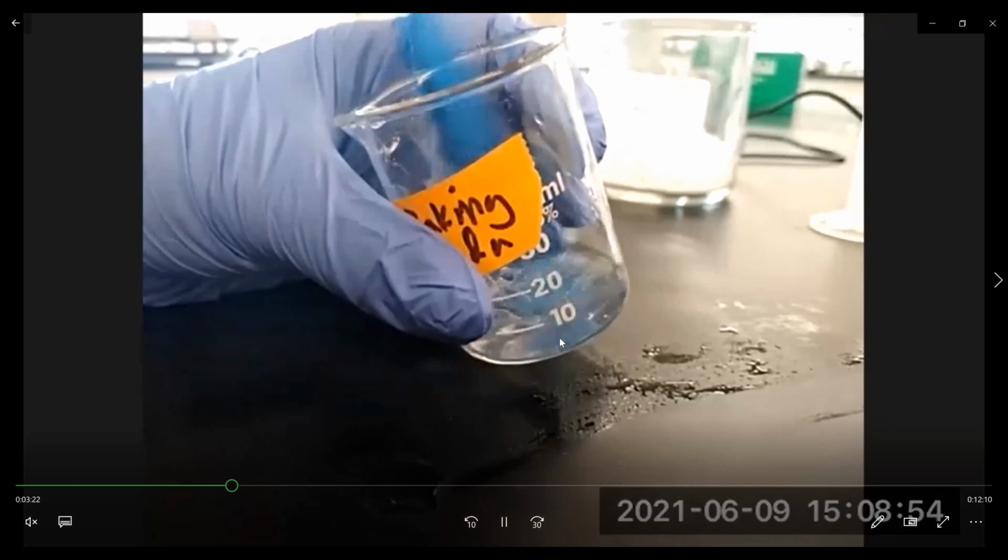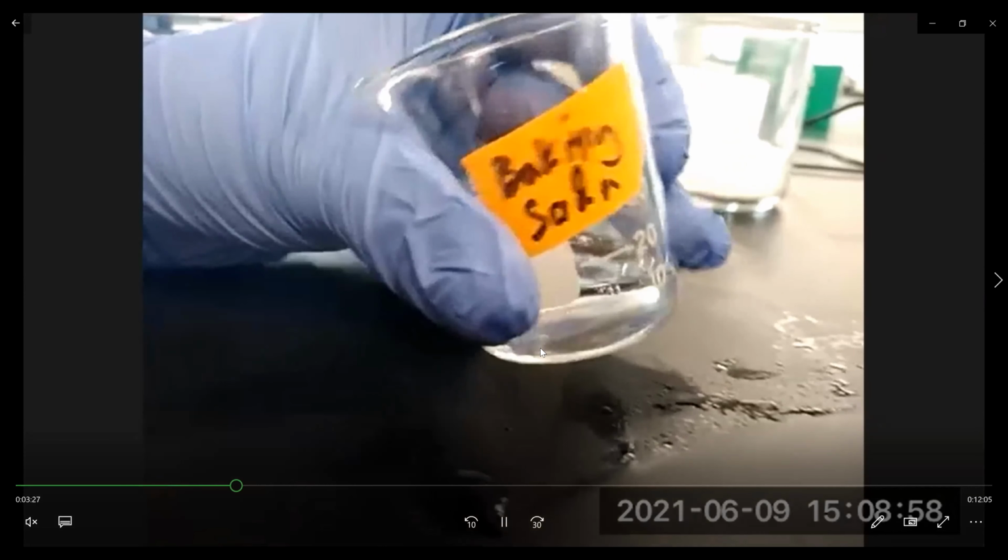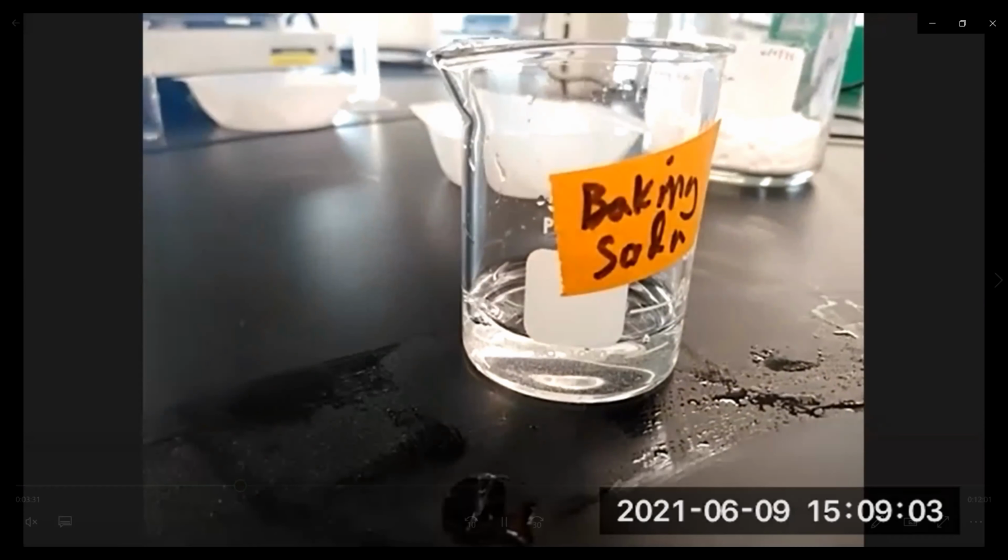And you keep on mixing it until it becomes colorless. So now we've prepared the sodium bicarbonate for the experiment.